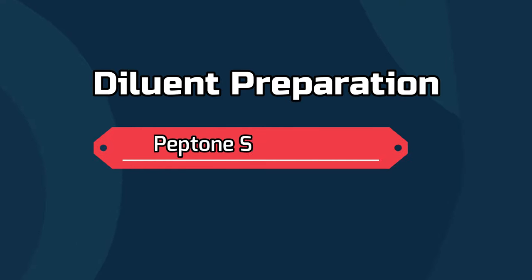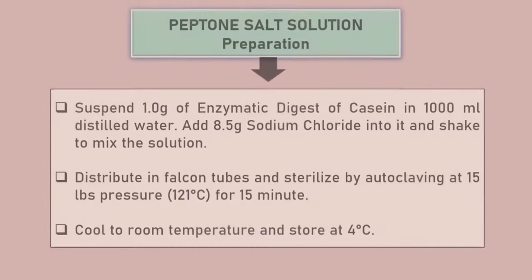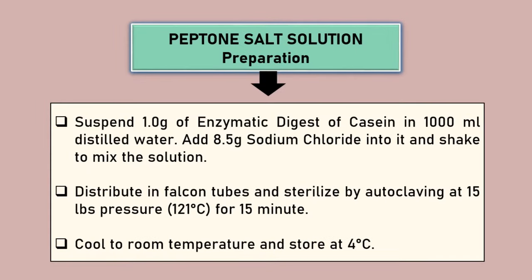Peptone salt solution can be prepared by suspending 1 gram enzymatic digest of casein into 1000 ml distilled water and adding 8.5 grams of sodium chloride into it. Distribute into Falcon tubes and autoclave at 121 degrees Celsius and 15 pounds for 15 minutes.